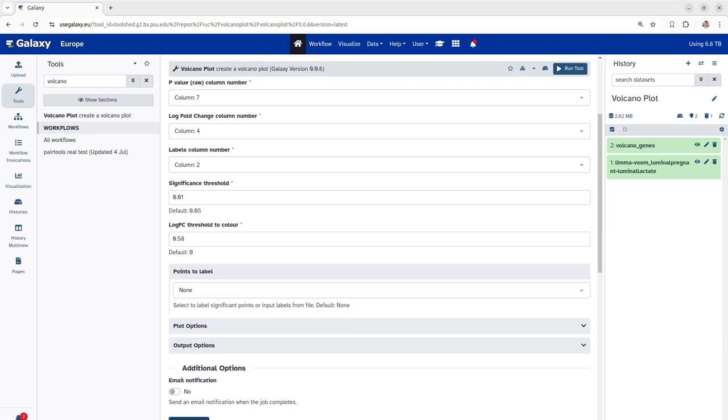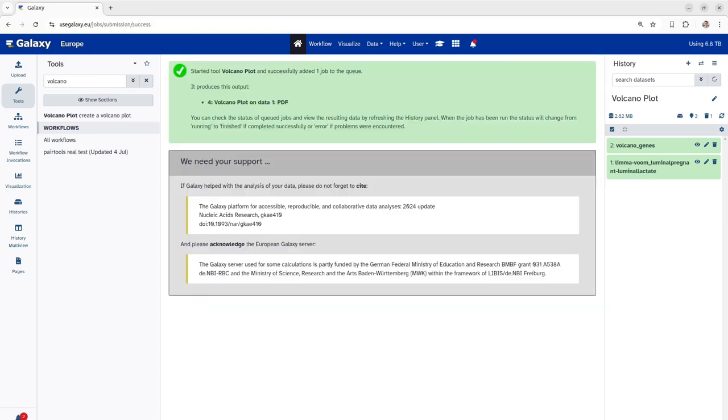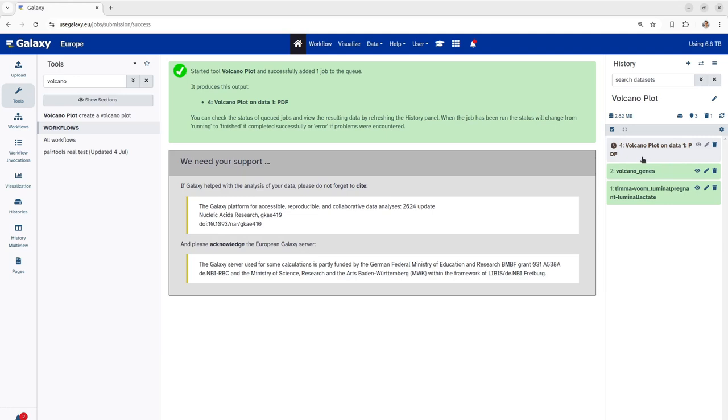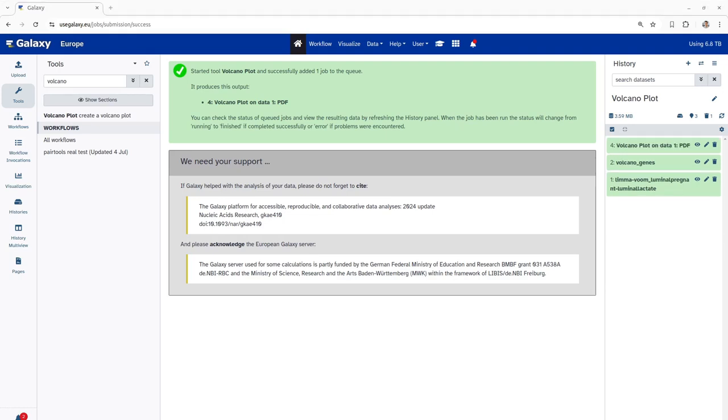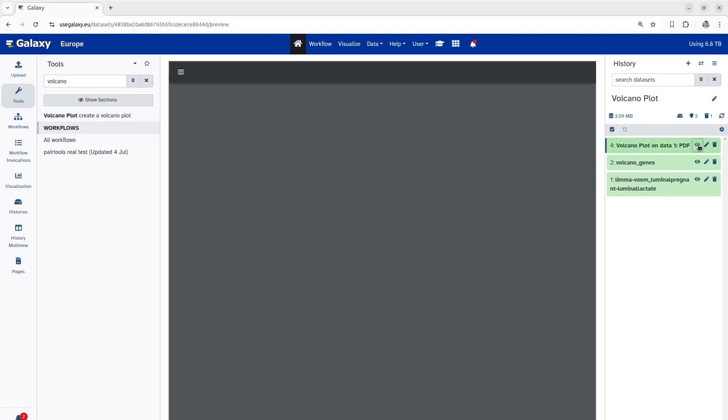To run the tool with the given parameters, you have to scroll down and click on the run tool button. This will trigger the tool to run with the specified parameters. Once the tool has been run successfully, the grey icon here will turn into green. As you can now see, our volcano plot has been completed and let's now inspect it by clicking on the display button.